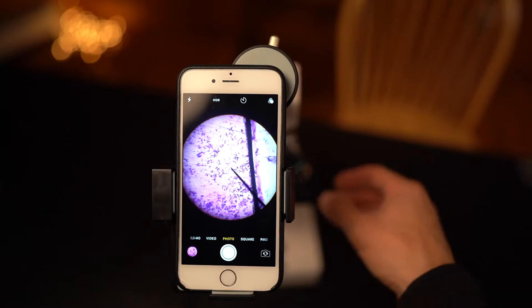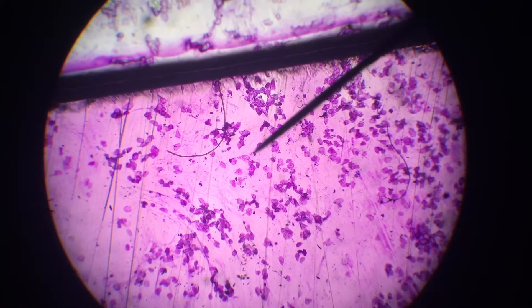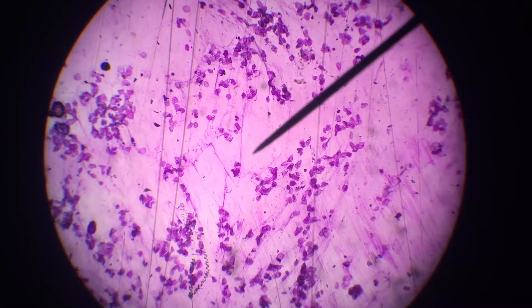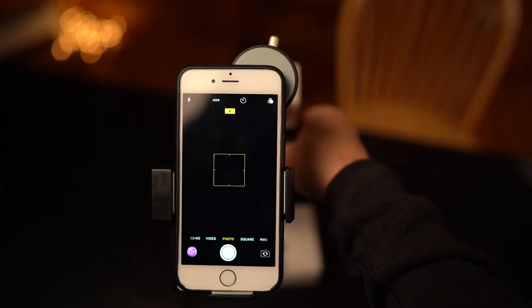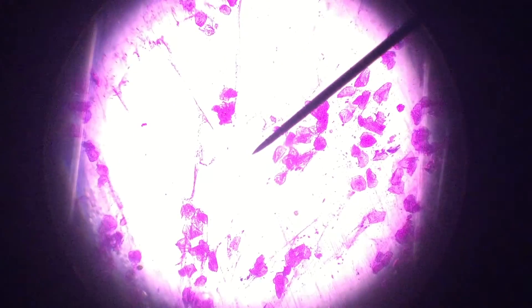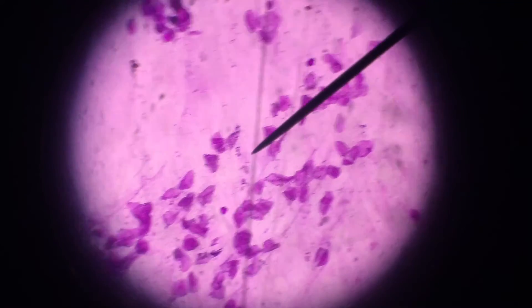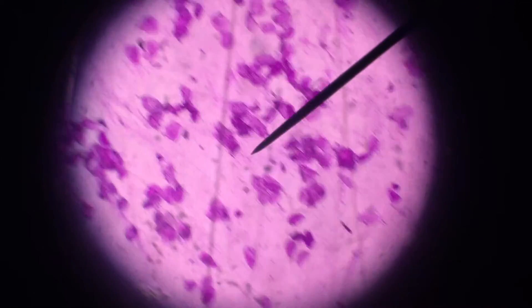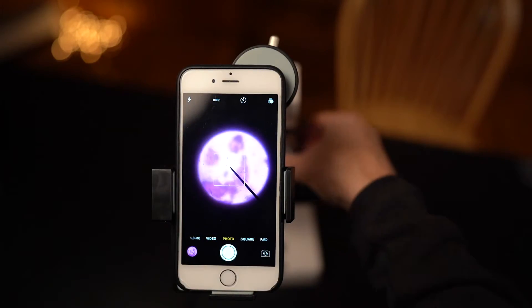Here we have the microscope under low power and you can see all these tiny little cells — I just did a tiny scraping and I got thousands of cells under there, pretty amazing. Now I am going to go to medium power, and obviously we see less of our slide but more zoomed in, so our cells look a little bigger. Again, pretty amazing to see all these individual single units.